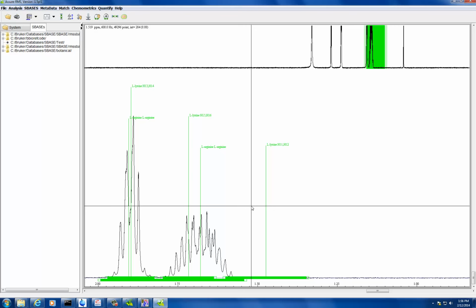For my compound, the peaks come very close, like how you showed me for ursolic and oleanolic acid. You can't even differentiate between those two. How do you quantify those two in a mixture of compounds? We would need to see the spectrum and see if there's a way we can resolve it. There are different fine-tuning techniques to separate those peaks, then define that region and quantify that region. If you can show me the spectrum, we can play with it.